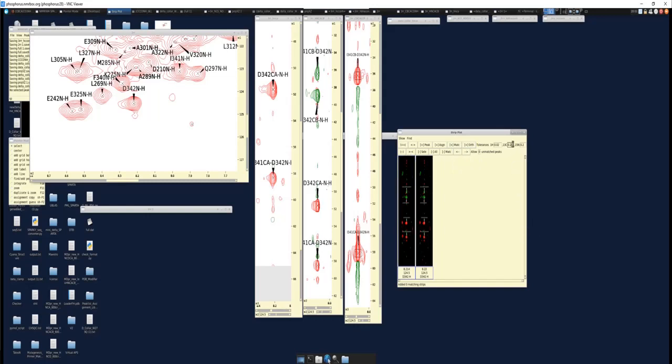Sometimes if you have a slight shift in your spectra, as you can see here that I sort of do, see how the C alphas don't perfectly line up, and the C betas don't perfectly line up. There's a small referencing issue here. You can either correct the referencing for that, or I'm just going to cheat and make my carbon tolerance here a little bit wider so it looks for a wider range.